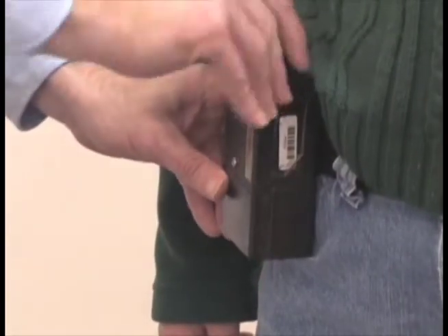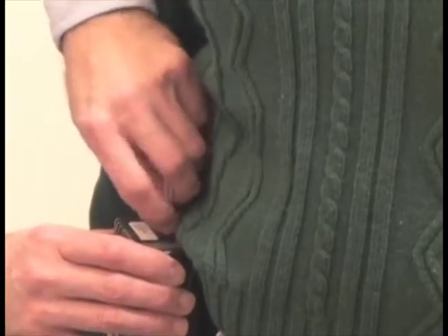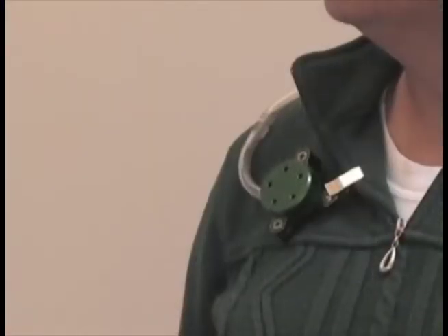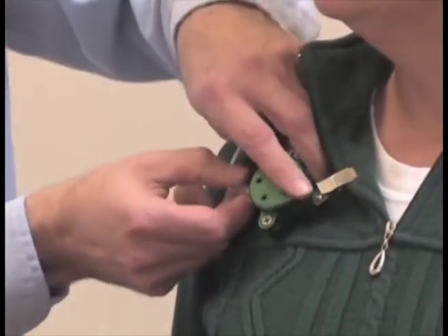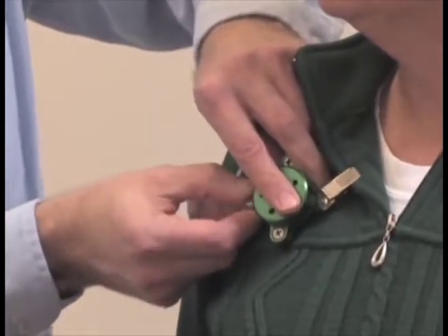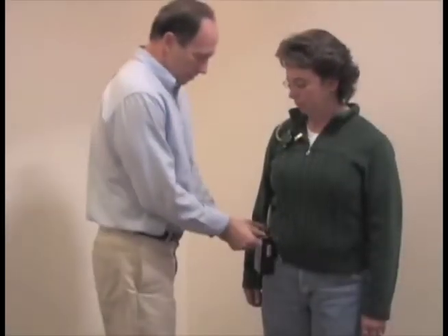Turn on the pump and record the time to the minute that you started the pump. Ensure that the outlet of the PEM sampler is connected to the inlet of the sample pump. The flow rate of the pump is calibrated to 2 liters per minute. Also, ensure that the sampler inlet is facing away from the worker.